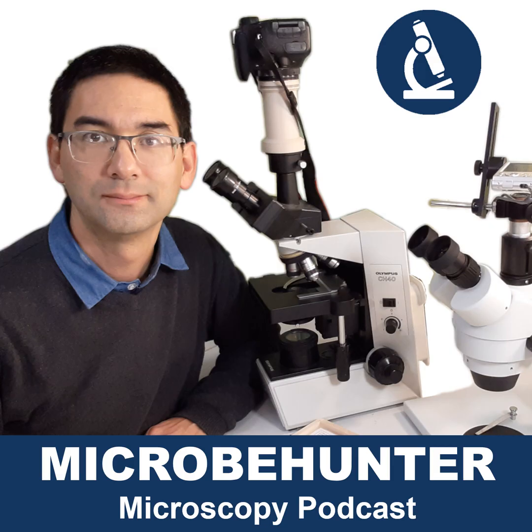The reason is because I myself like to observe water samples, and DIC allows you to see unstained samples better, but it does not introduce so many optical artifacts. So it gives you a more natural picture. That's why I probably would go for DIC if I had the choice. Fact is, I cannot afford it. That's on a different level.